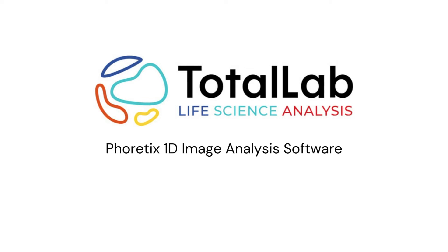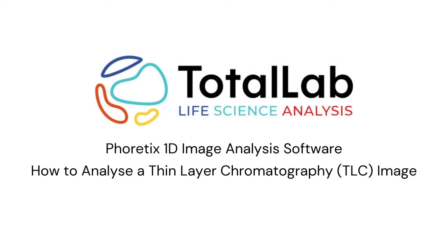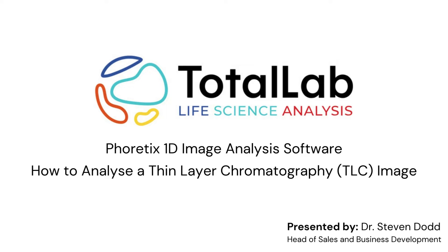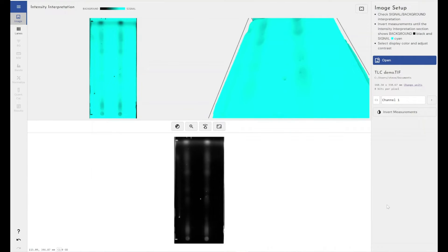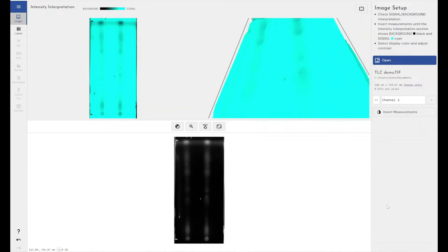Hello everyone. Today I'm going to show you how you can use Phoretix 1D to analyze your thin layer chromatography images. I'm going to be showing you how we can analyze a thin layer chromatography image, gel, slide, however you've managed to do it, within our Phoretix 1D software.